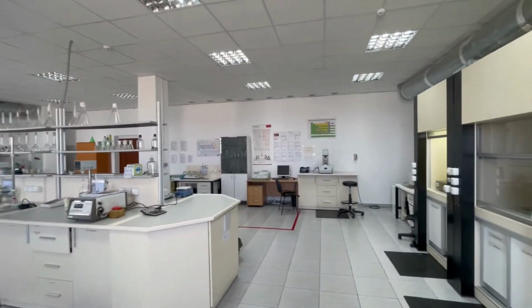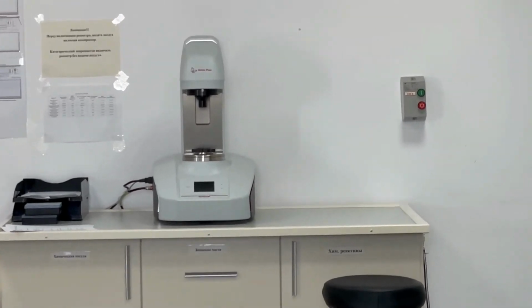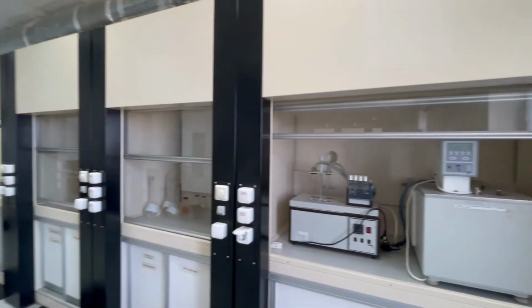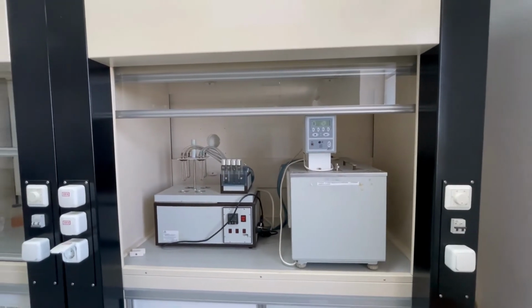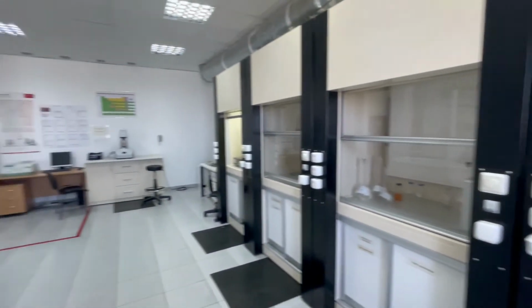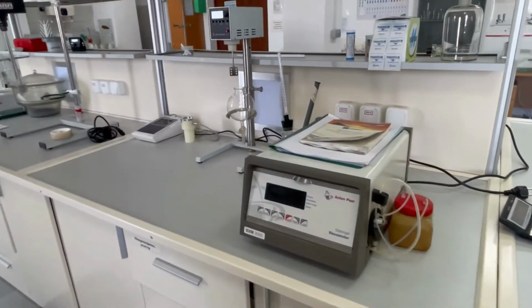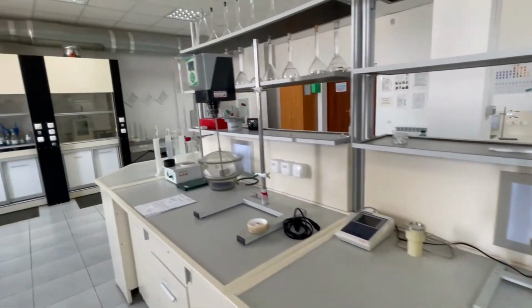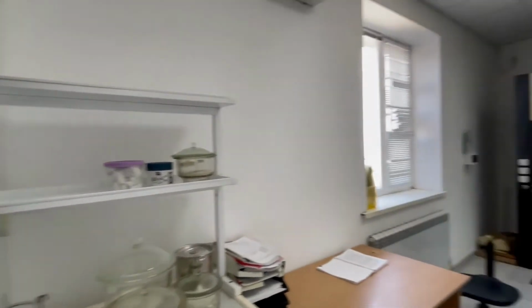From the equipment we have a rheometer MCR92. Here we have an installation for evaluating the effectiveness of ARPO inhibitors. Here we have a Stabinger viscosimeter, the extractor. Here we have a polytron.